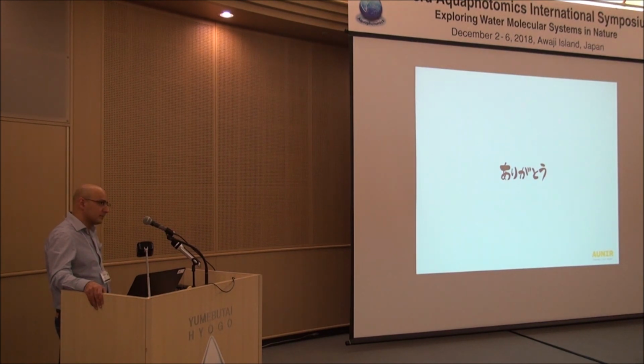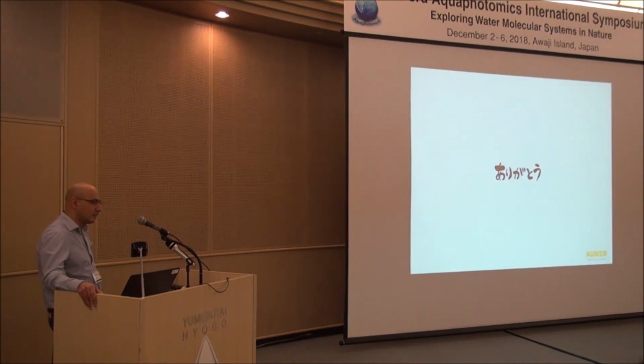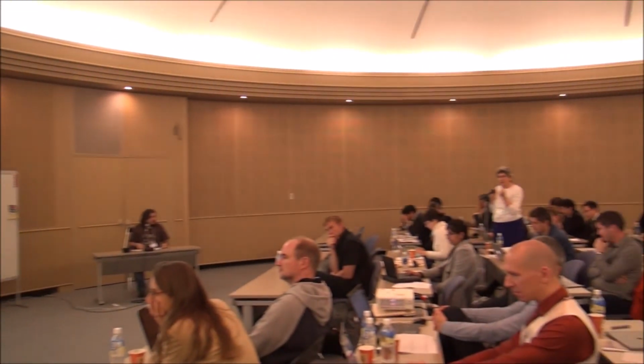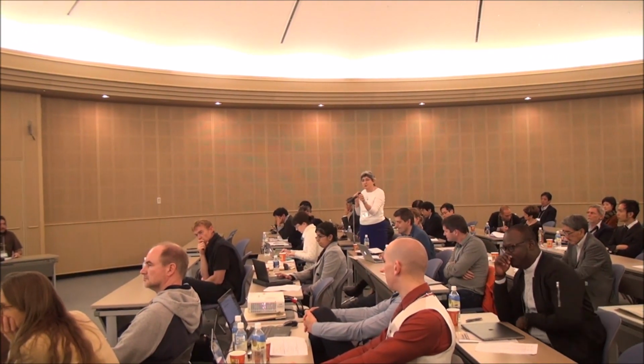And now, listening to you, I thought we have to have an experimental design for how to measure. And now the question is, do we have a way to see the residuals? When you do your orthogonalization, deweighting, we would like to see what the residuals are, because that will be very important information for the water, right? Of course.